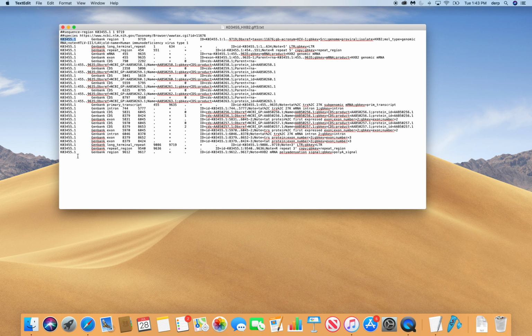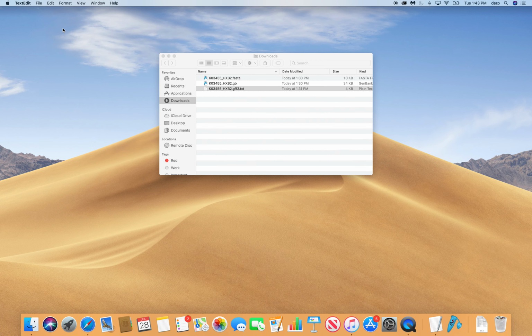But this is, in general, a tabular way of looking at information that we had been looking at previously in other types of formats. So the jargon can get complicated, and part of that jargon winds up being these formats, but these formats all have very particular types of uses that we'll be getting to very, very soon.